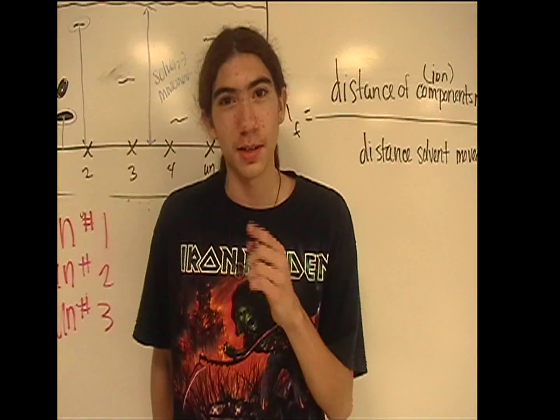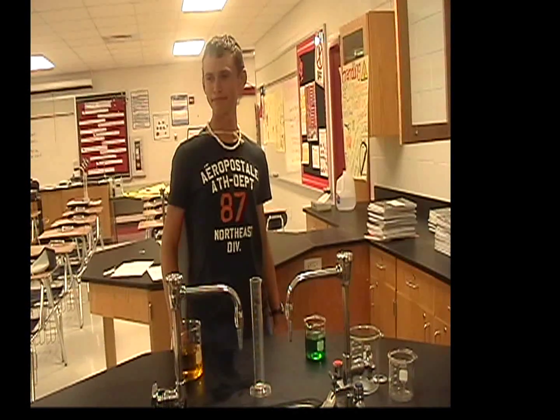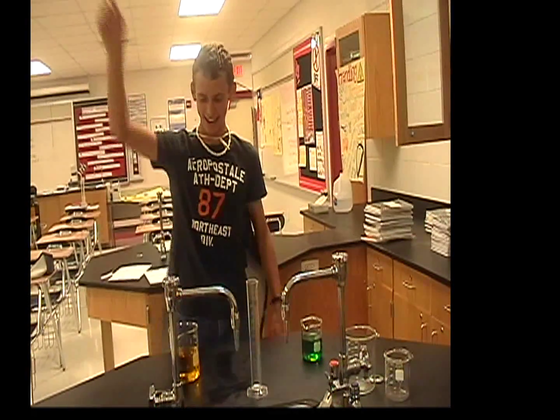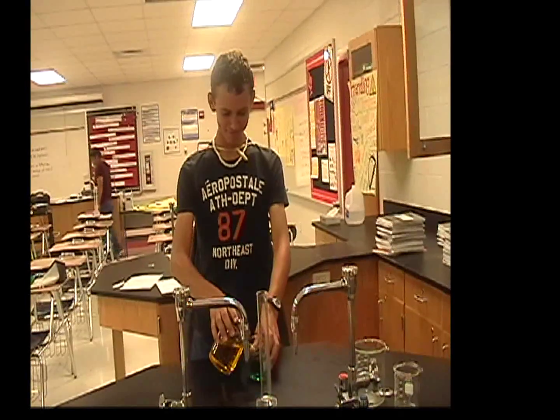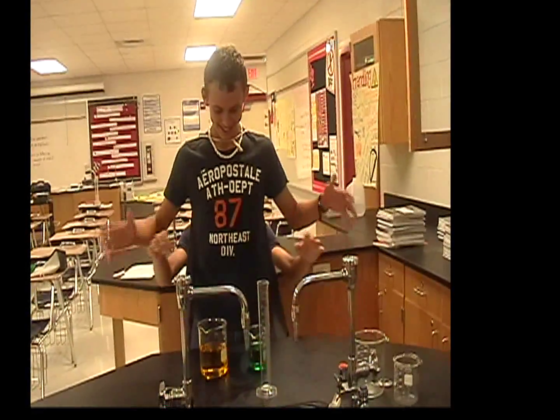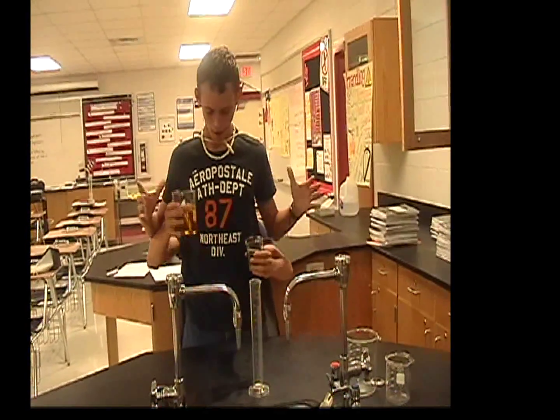Now we're going to teach you why not to touch chemicals and what's going to happen if you do. Notice how he's still not wearing his proper gear. The character declares 'I'm Superman — nothing can affect me,' then touches the chemicals and reacts with shock: 'What is this? I have two more arms!'